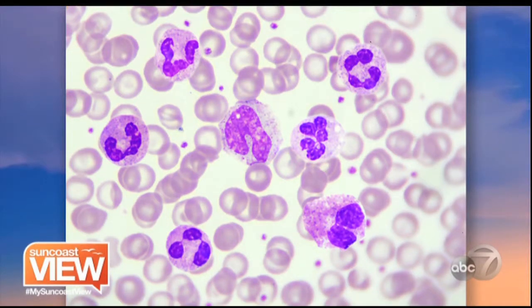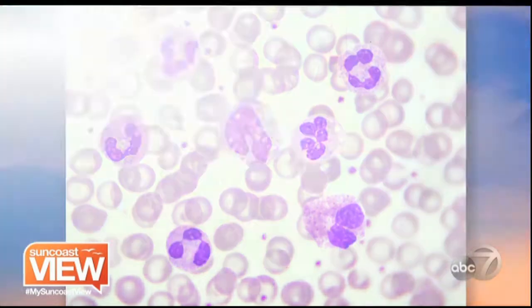But look at the white blood cells on there. You have the Pac-Man cells, the ones that look like little Pac-Man, right? So they're going in there and eating foreign bodies in the body. So funguses, parasites, molds, free radicals, cancer cells, dead bacteria, phytotoxins, endotoxins that your body's not really supposed to have. And we're always being bombarded in our environment by toxins, so xenoestrogens, phytoestrogens, so you rely on those white blood cells to go in there and fight your battle.